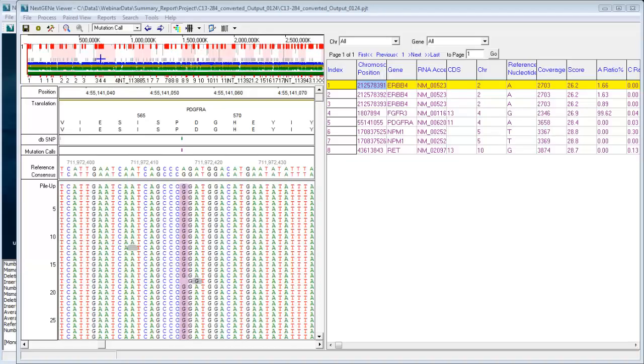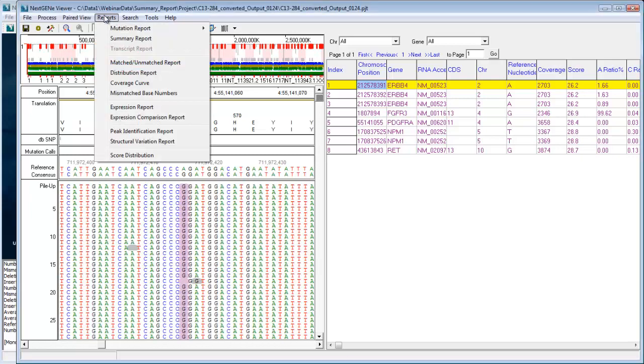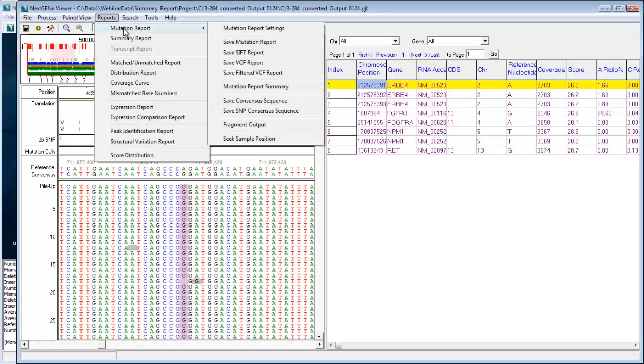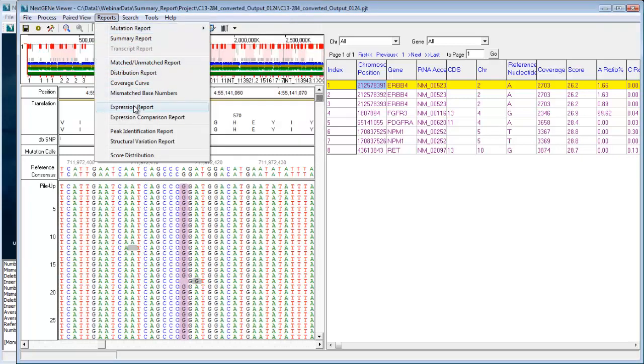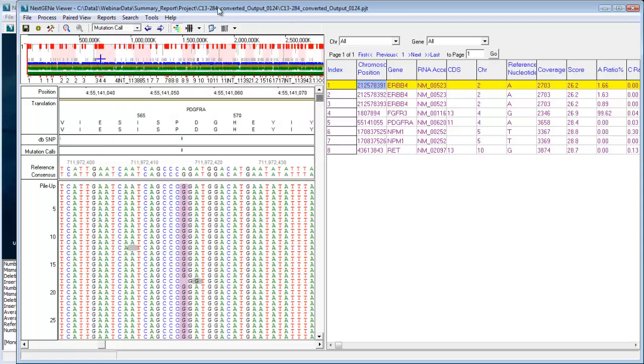For those of you familiar with NextGene, you may know that there's several reporting options available, including mutation report, expression report, coverage curves, lots of different reports available to you. And what the summary report is capable of doing is bringing all those reports into a single report that can be saved as a PDF.